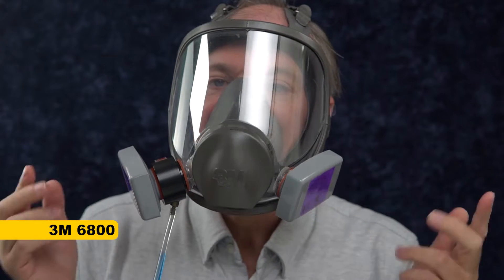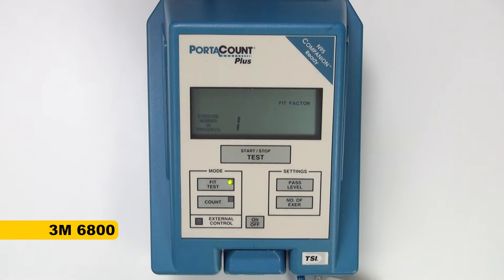Okay, we've got the mask on for our initial test without glasses, and we're going to see how well it does with just the mask normally worn. The result: 8270 — that's a very good fit factor.